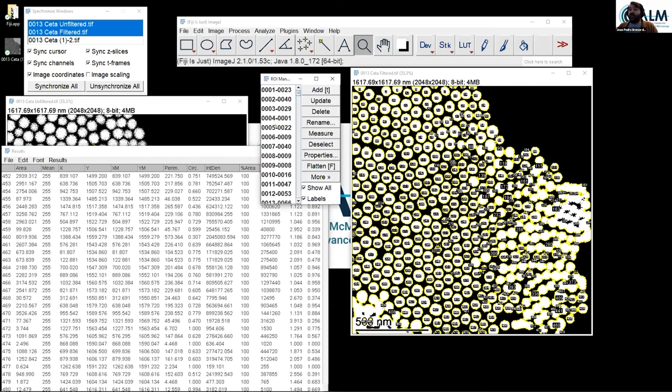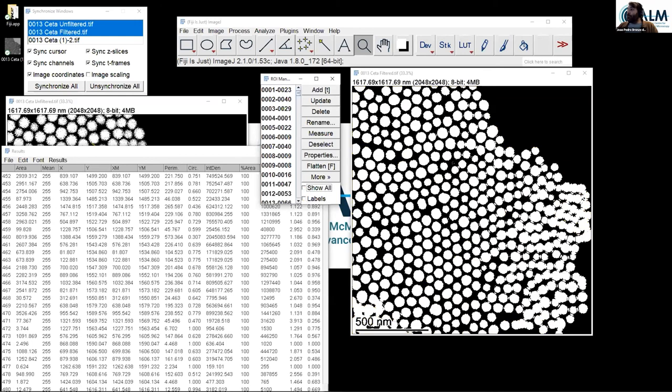we have this ROI Manager window present. And as you can see, this has the different ROIs that the software detected. And if I go one by one, you see that number one is actually that area there. If I start scrolling down, you see that I'm going to start creating these different objects. Okay. So if you want to see them all, this is what it captured.